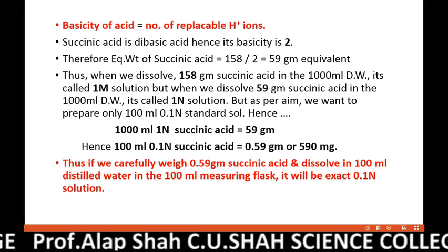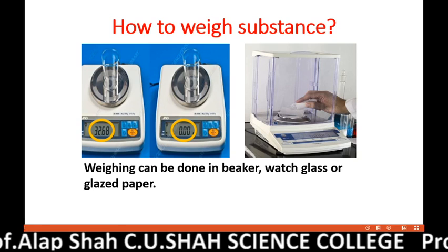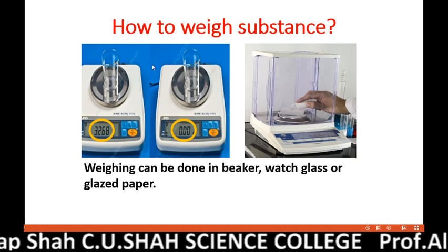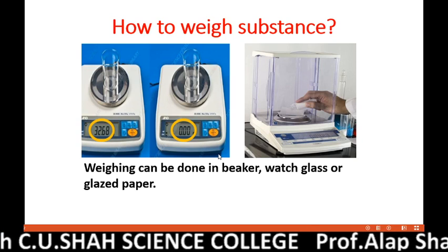Now let us check the practical. In the laboratory, we have this kind of analytical balance or digital balance. It is the same kind of balance you must have seen at provision stores, grocery shops, or a dairy shop.